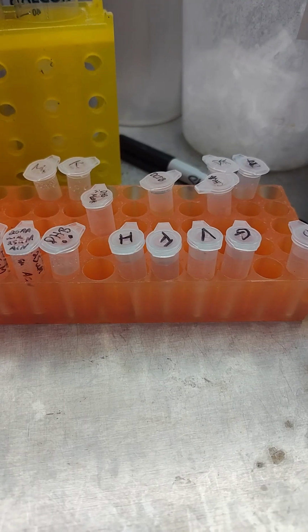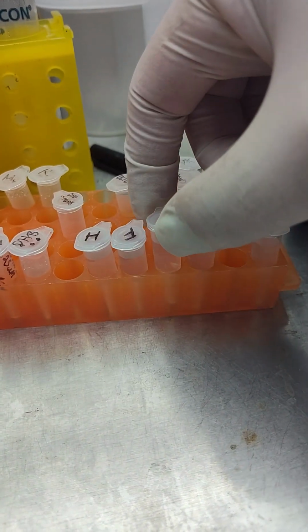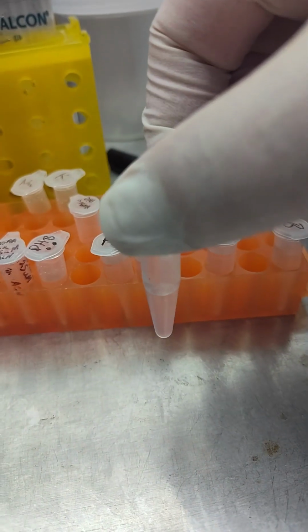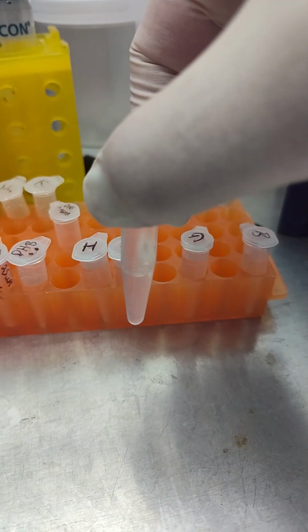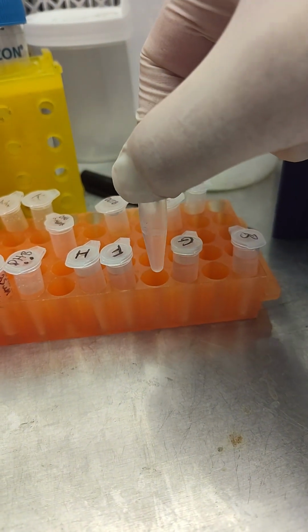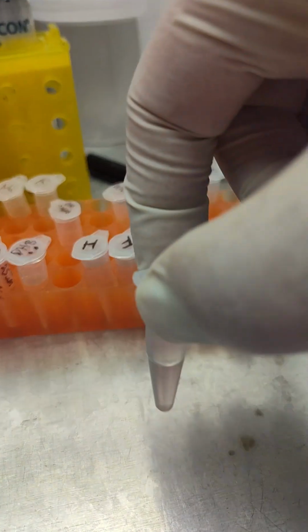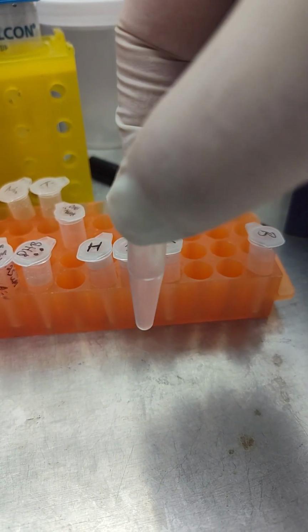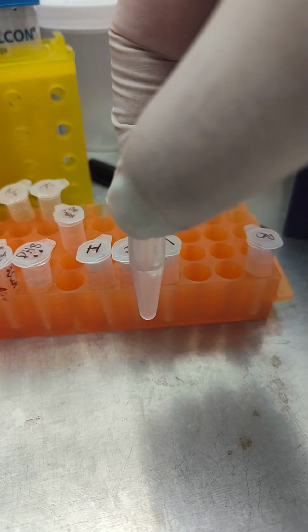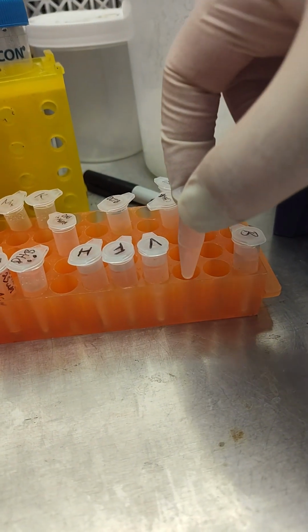Alright, so this may be hard to see, but I want to show, okay, let's look at the Viore. You can see the interface. You see that little layer sitting in between the two layers. It's a pretty good sized interface in the Viore. And then we go to the Gildan. You can see there's almost no interface. So that's really cool. That means nothing's precipitating out at the interface. So I like that one.